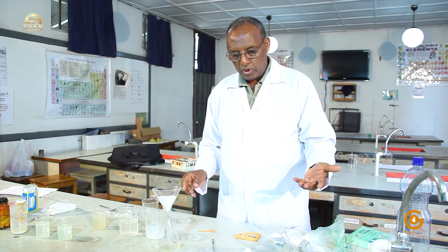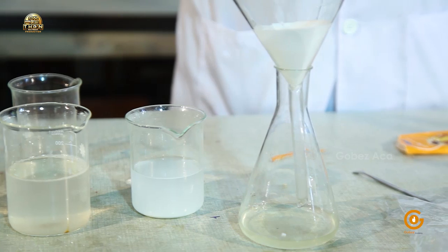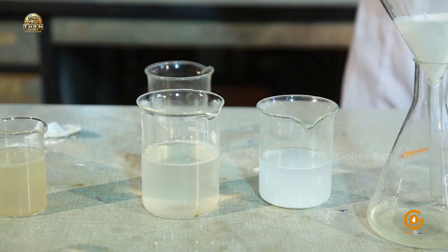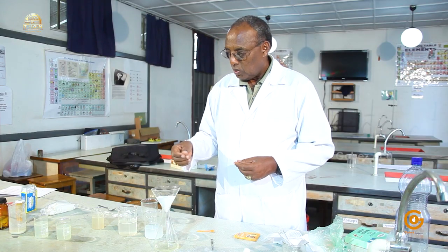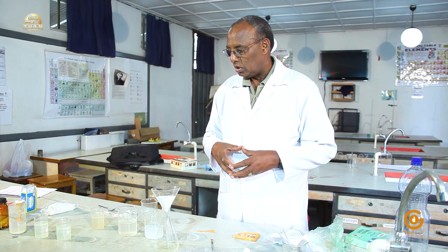We also took metallic sodium out of the kerosene. It's a very soft metal, with properties unusual compared to what we know so far about metals. When we dropped it into water, it reacted vigorously, producing hydrogen.